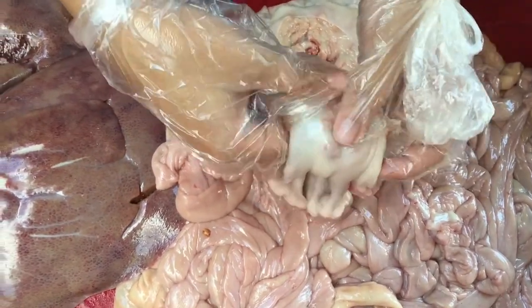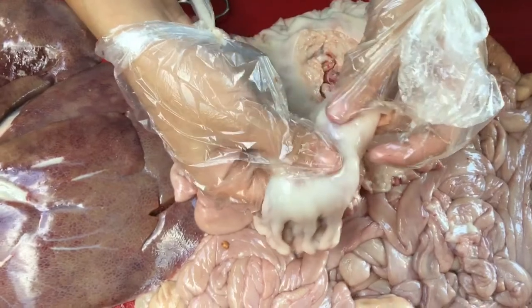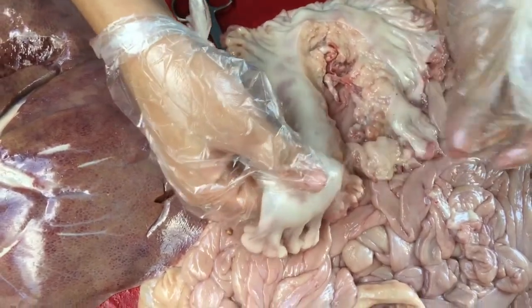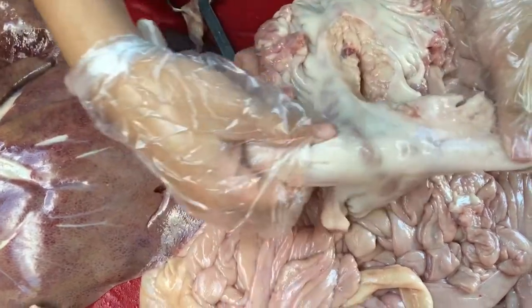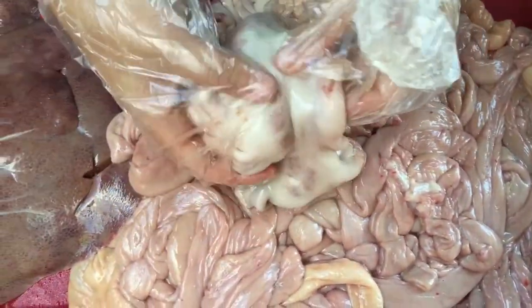The mesentery's unique structure also includes this fat. This is where the body stores fat. Here, there is the storage of fat. So this is the small intestine and the mesentery.